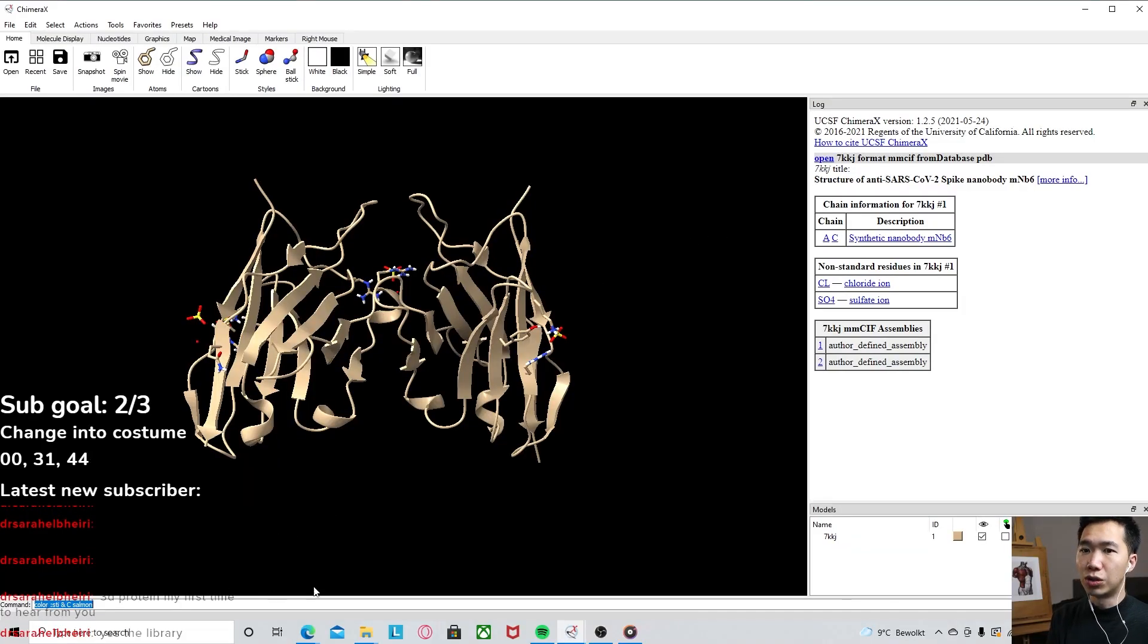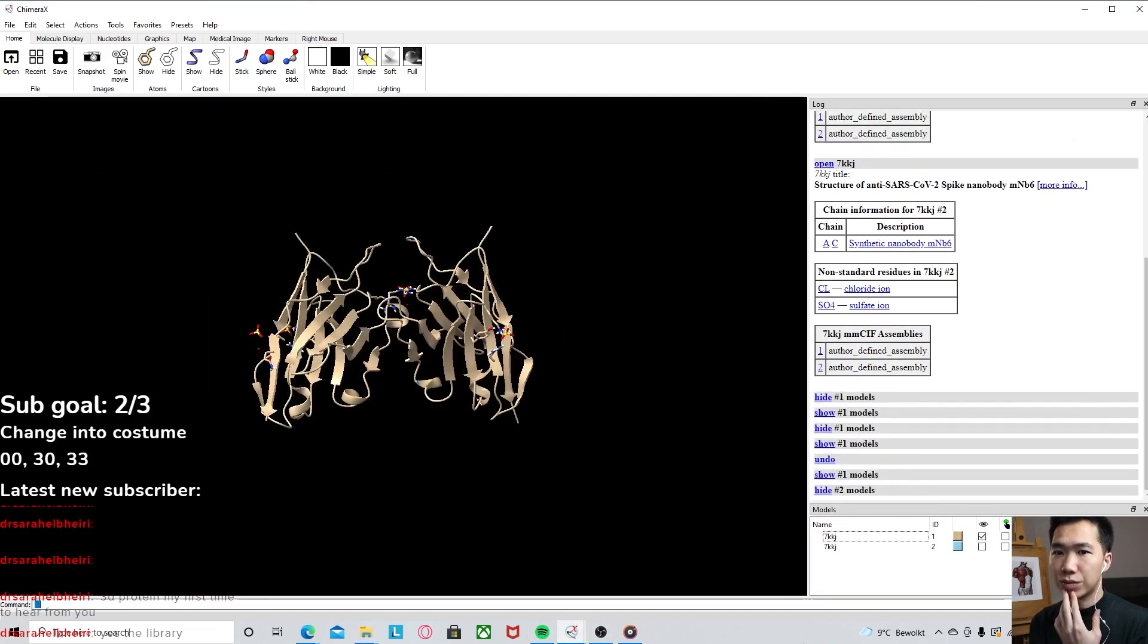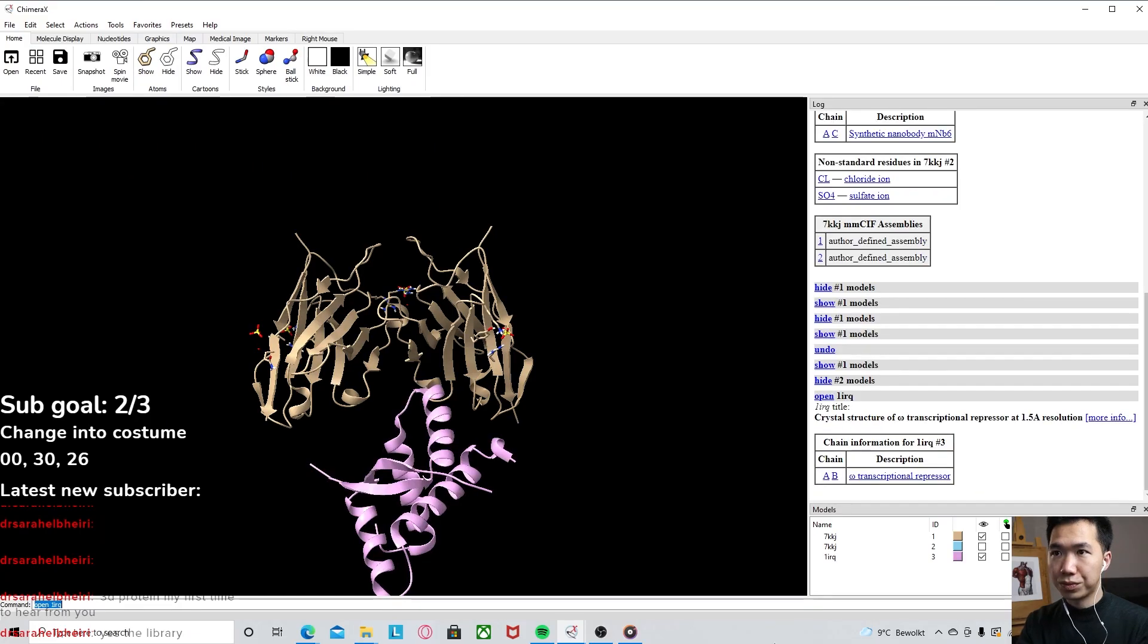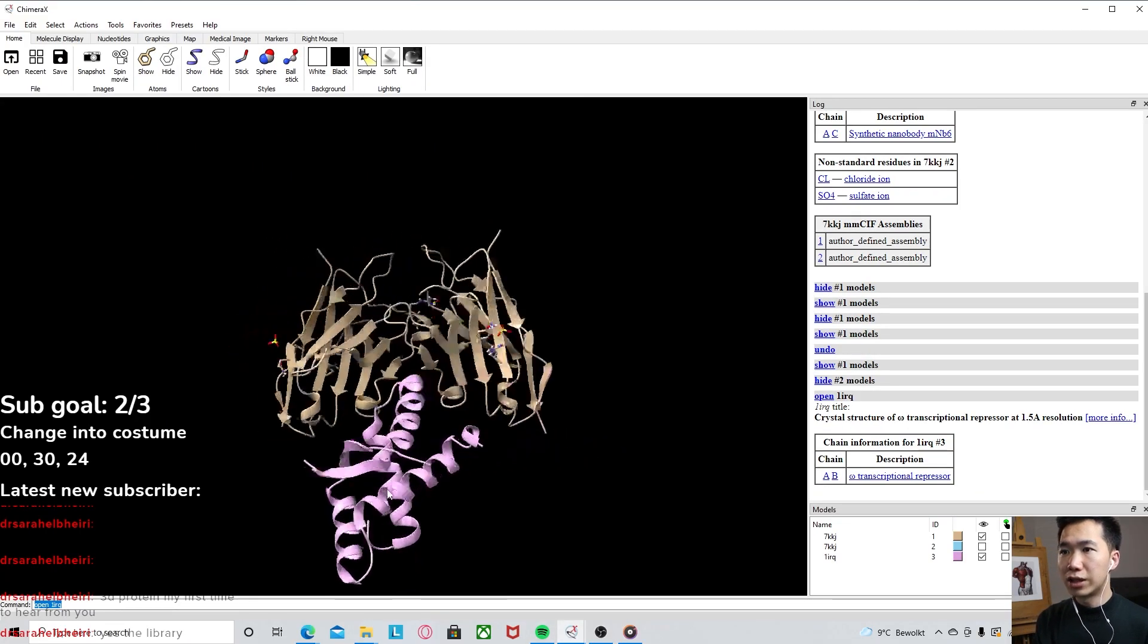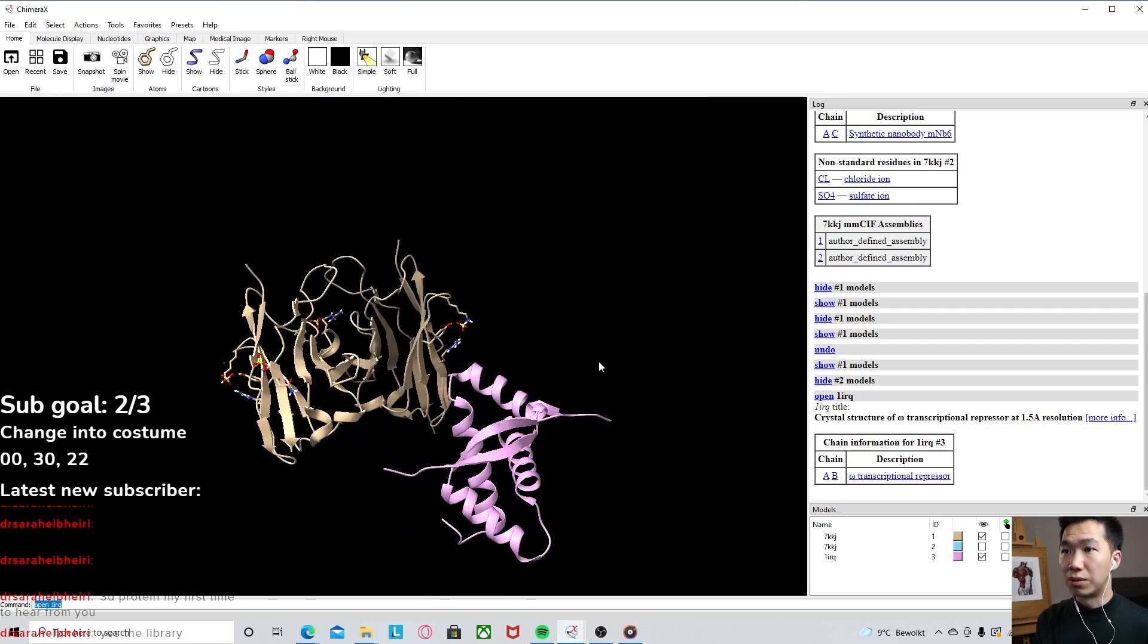So let me show you. If you come down here to the command, when you type open 1irq and press enter, then you get the other protein.